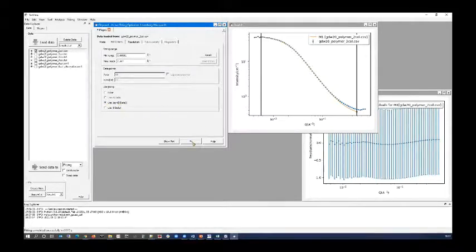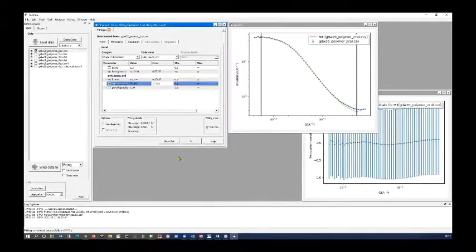So having checked that box, let's see what happens. We'll just go back to the parameters. Let's see what happens if we click fit. There you go. See, it has actually improved the fit. It's made a small change to the parameters there. So only having 2 columns of data, not really what you want. You want more than 2 columns. 3 is a minimum.